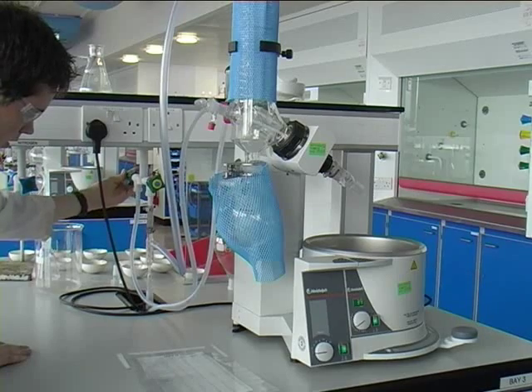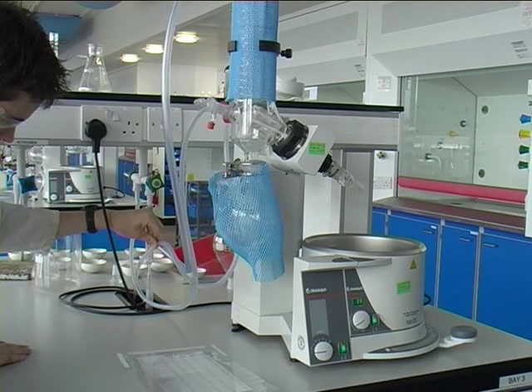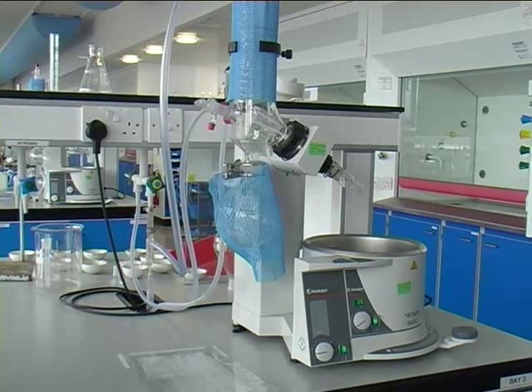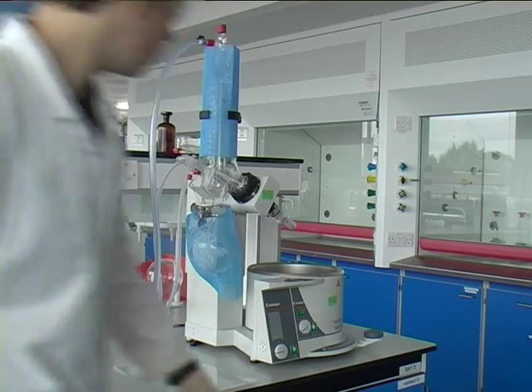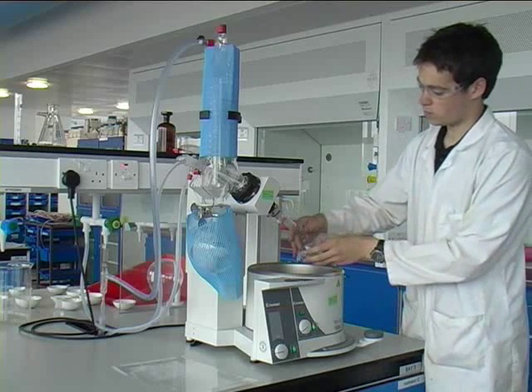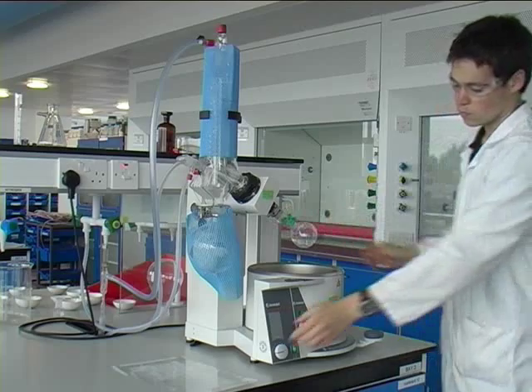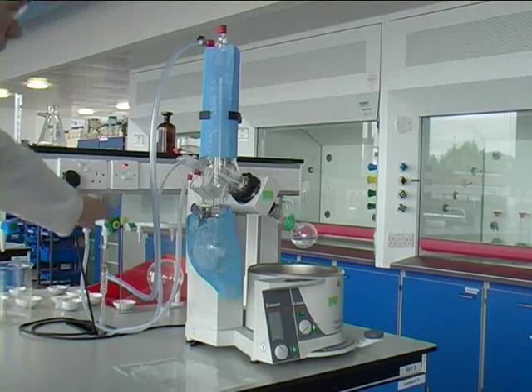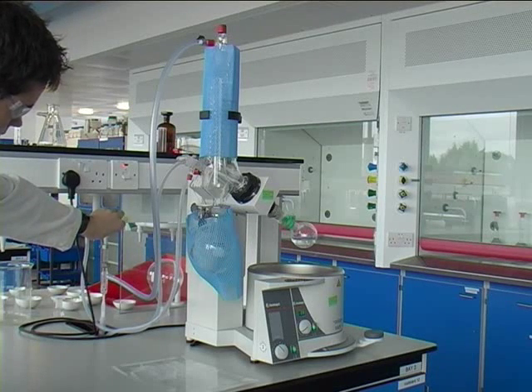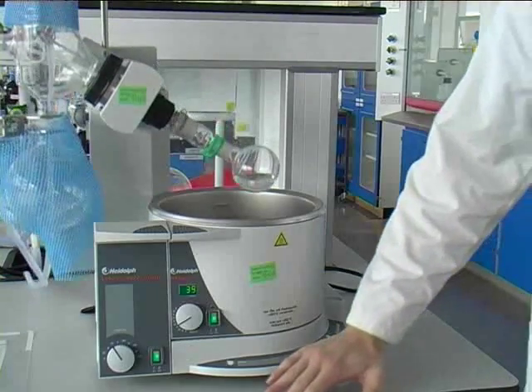Turn on the cooling water. Close the red screw cap. Fit the round bottom flask and secure with the green clip. Rotate the flask and fully open the water venturi tap to create a vacuum. Lower the flask carefully into the water bath.